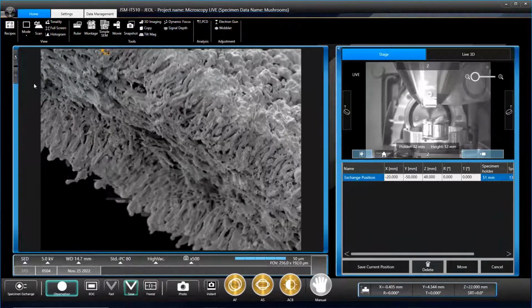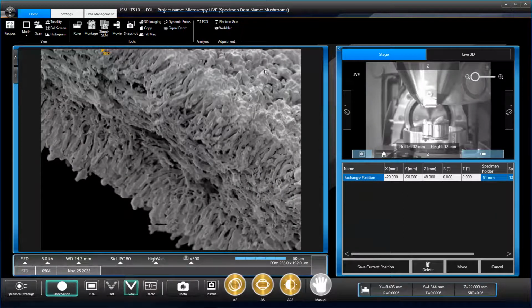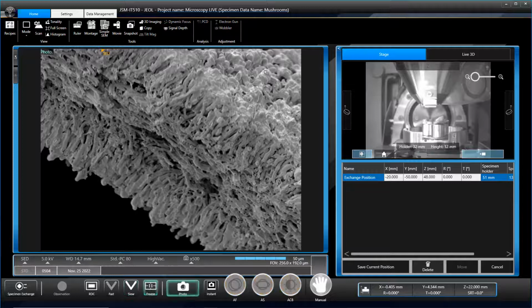It's cool seeing the difference, seeing it so tubey here and then the tops of them being so bumpy. Obviously, those are the right words to use, the scientific way. Again, I think it's the tubes of the hyphae in the middle. Even the gills, just outside of an SEM, I wasn't expecting them to be so tubey, so soft looking.